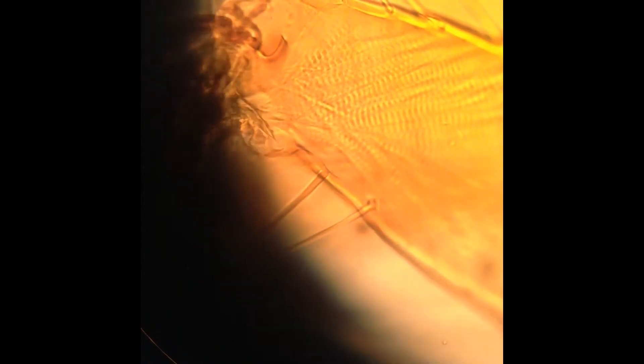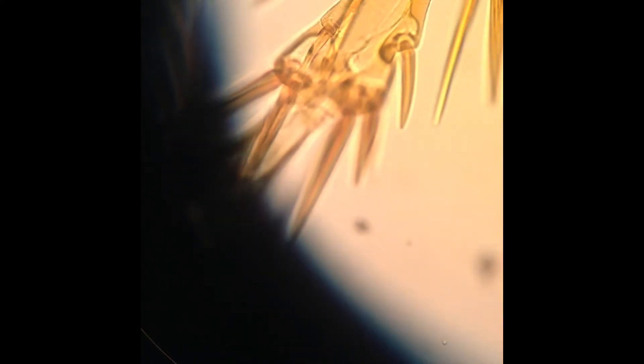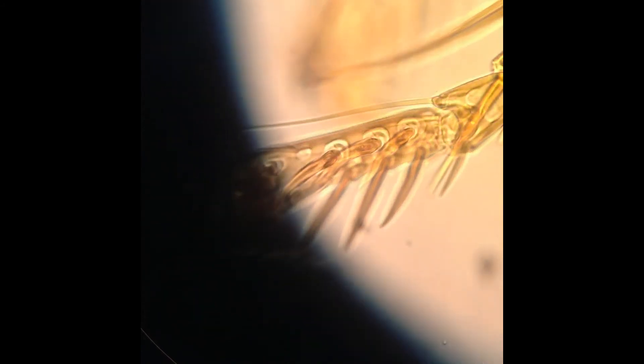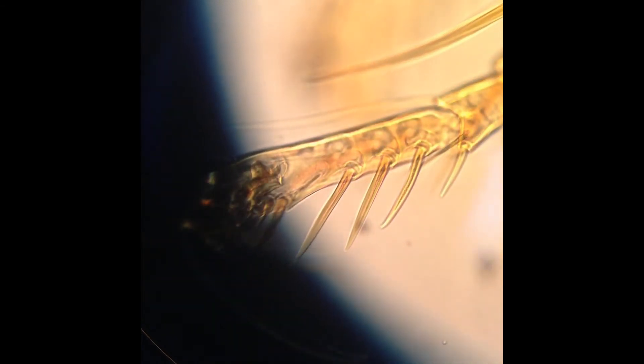There we go. Look at those spines. See the bottom. Wow — look at those hooks. I'm going to adjust the condenser again to see everything at once. Wrong way. There we go. I'm going to open it up a little though. Now I'm going to shut it down. There we go. Now I'm going to go to the 10x objective lens times the 10x eyepiece, which would make it 100 times magnification.